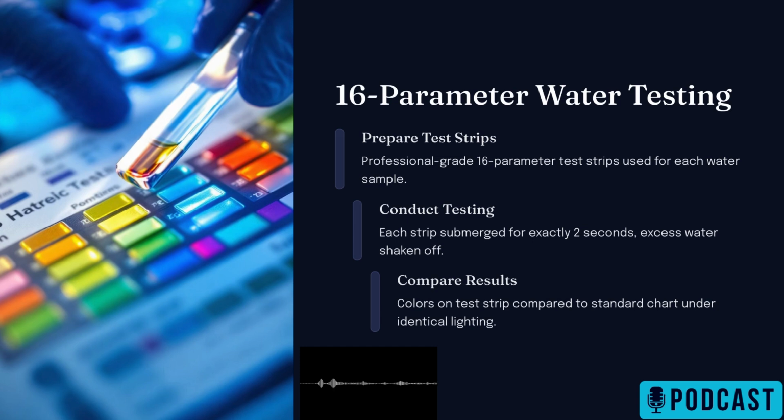Okay, let's shift gears then. What about pH? What did those test strips tell us about how acidic or alkaline these waters were? Right, pH. So for most of the purified water brands, that's your Essentia, Nestle, Dasani, Zephyr Hills, Walmart, Aquafina, and Smart Water, the pH levels were actually pretty consistent. What range? They were all hovering between about 6.6 and 7. So pretty close to neutral pH, which is 7. Exactly, pretty much right there. Okay, nothing too wild there for the purified ones.